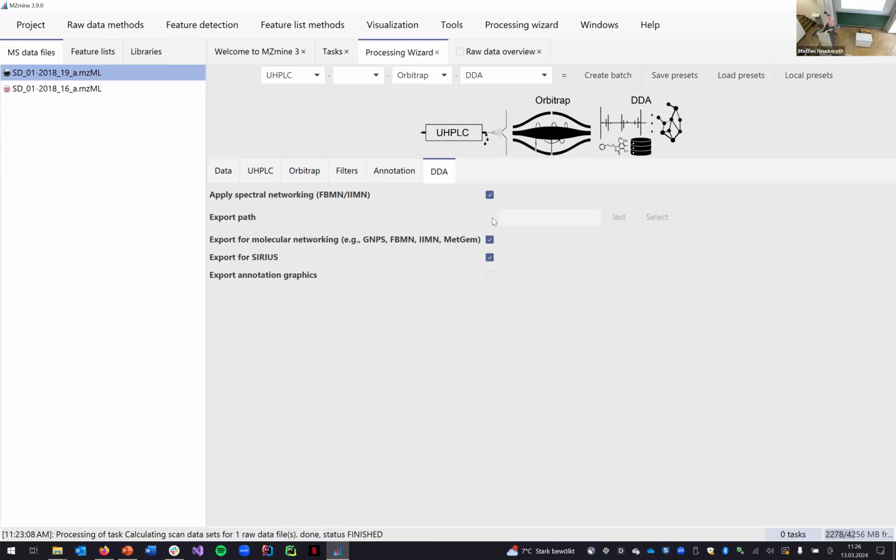Also on a similar note, we have an Agilent TOF, and it also says, yeah, you can do polarity switching, positive negative, within a 1 second cycle time or so. And the technician was at our place, and he said, never do polarity switching, it kills the instrument. So even the technicians from the manufacturers say, don't do it. It's possible, yes, but the power supplies are not made for it. So if you don't have a service contract and you'd like to keep your bill low, then don't do polarity switching, do two separate runs with both polarities. It will give you more meaningful data anyway.